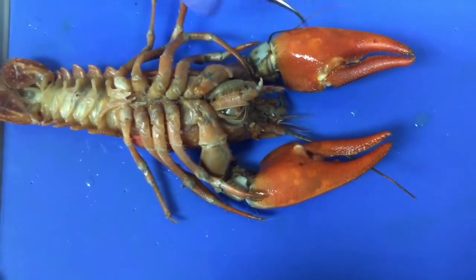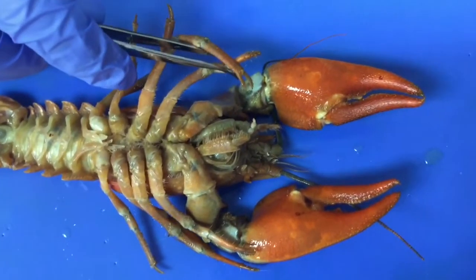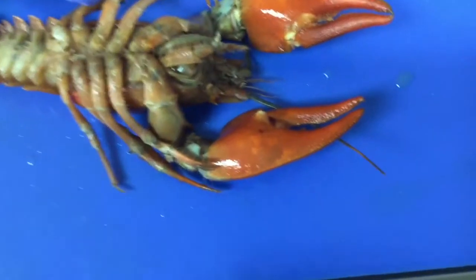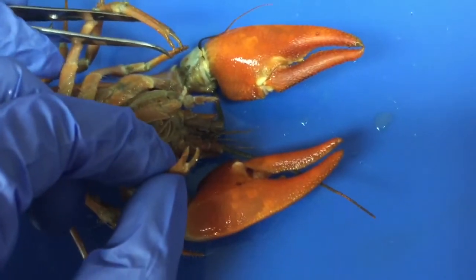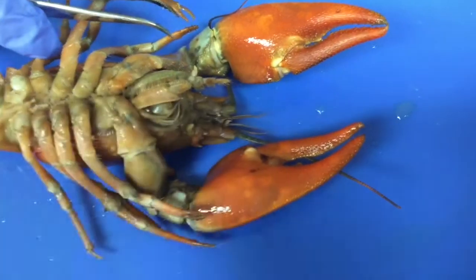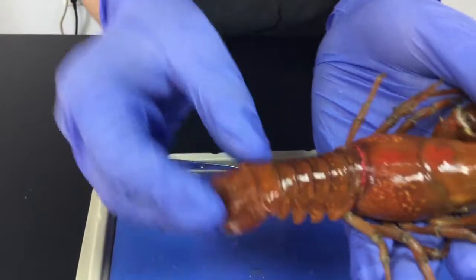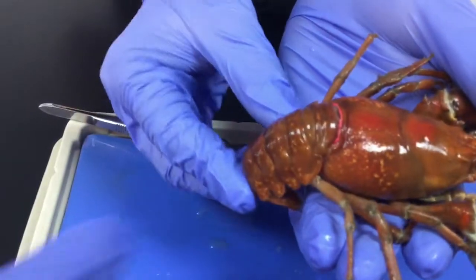Now, which walking legs have pinchers? Show us the walking legs that have pinchers. Look at that. More than just the first two huge claws, but we also have these walking legs. So there are actually two sets of walking legs with pinchers. Crazy, right? The uropod and telson make a powerful tail fan.